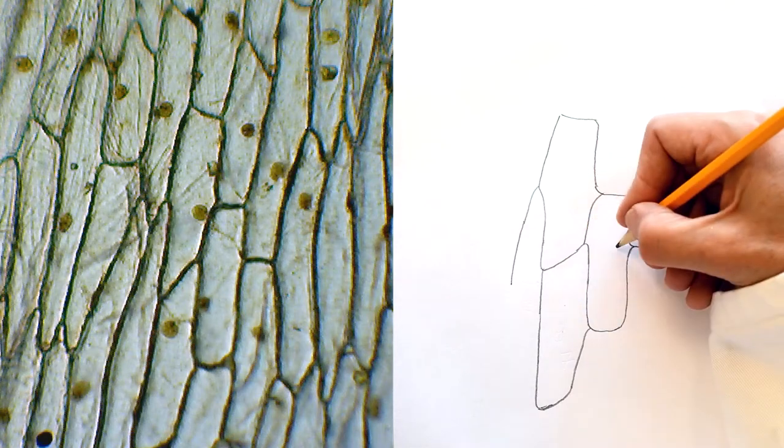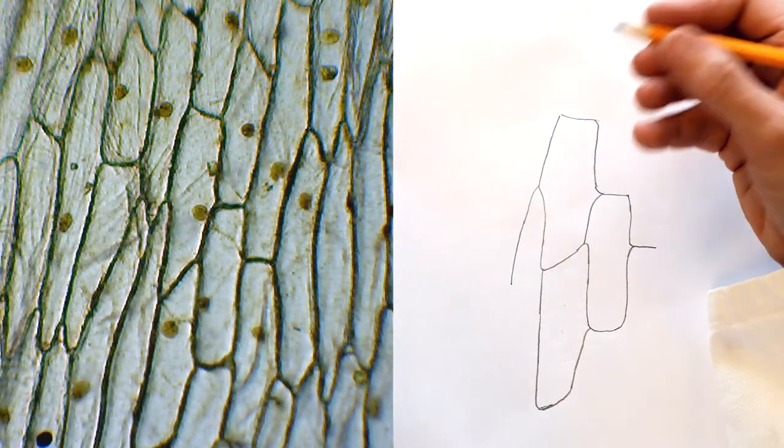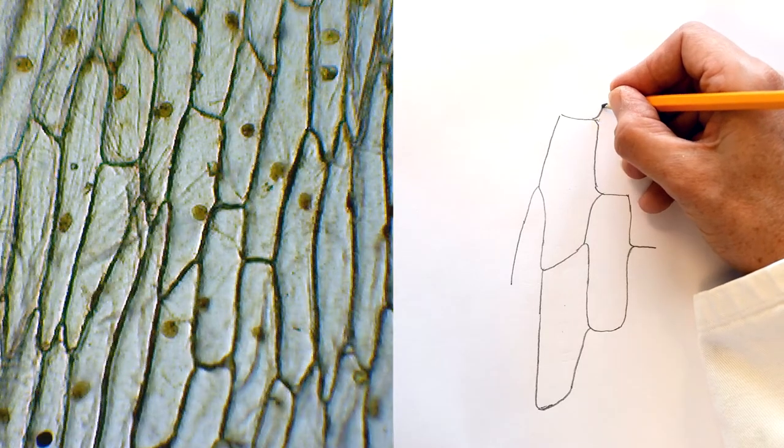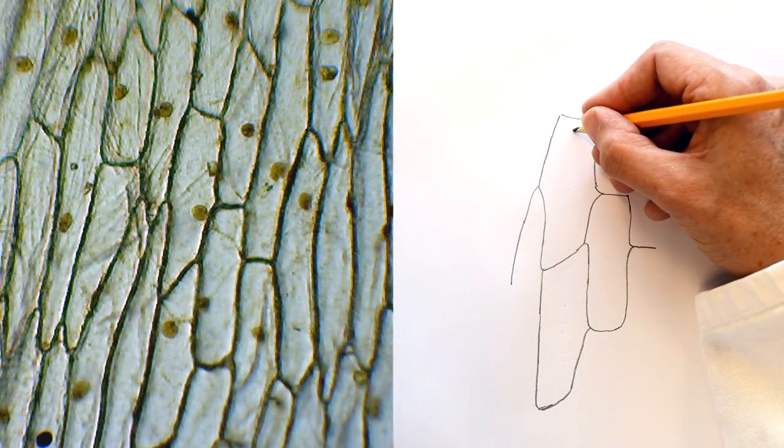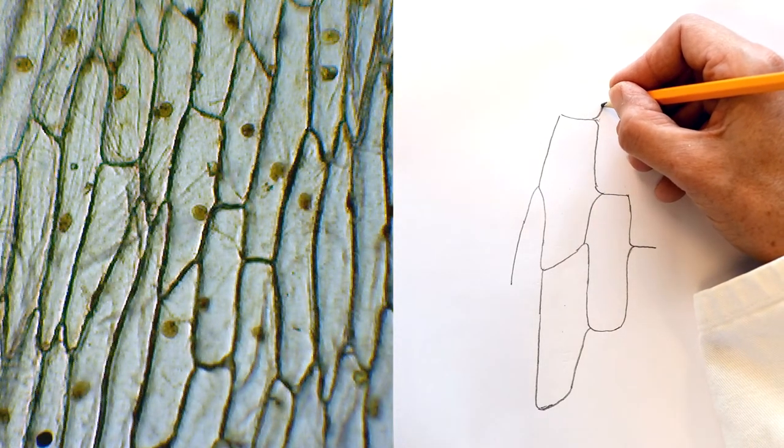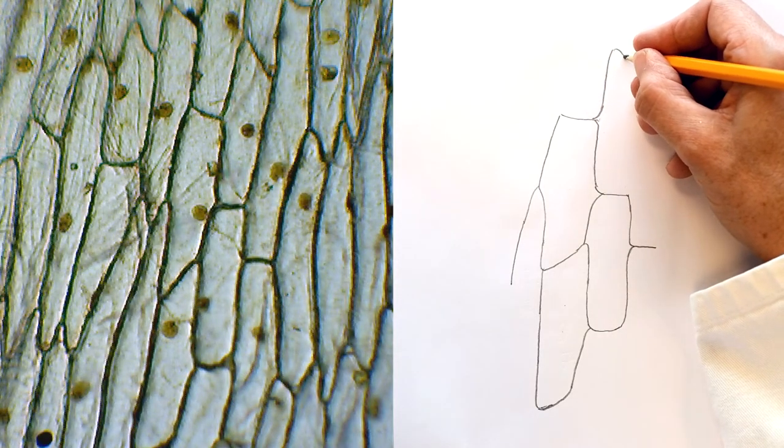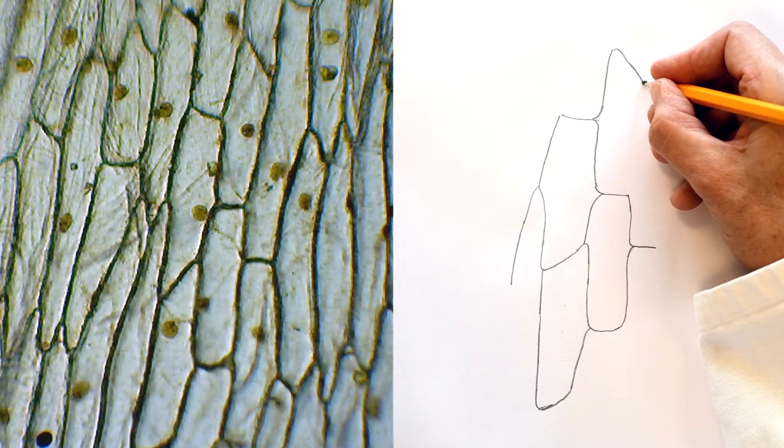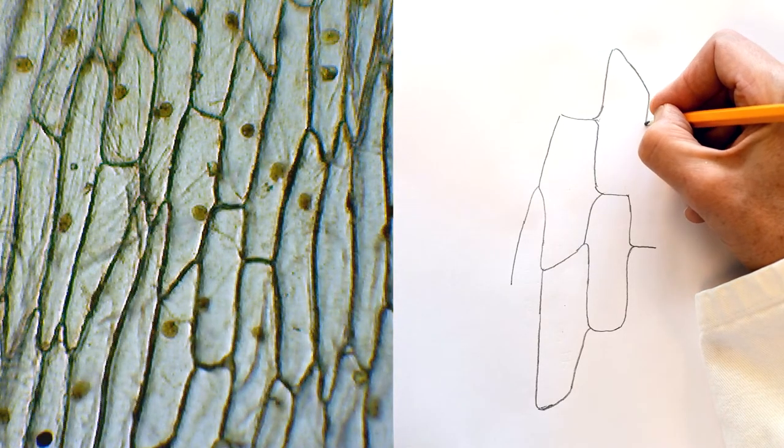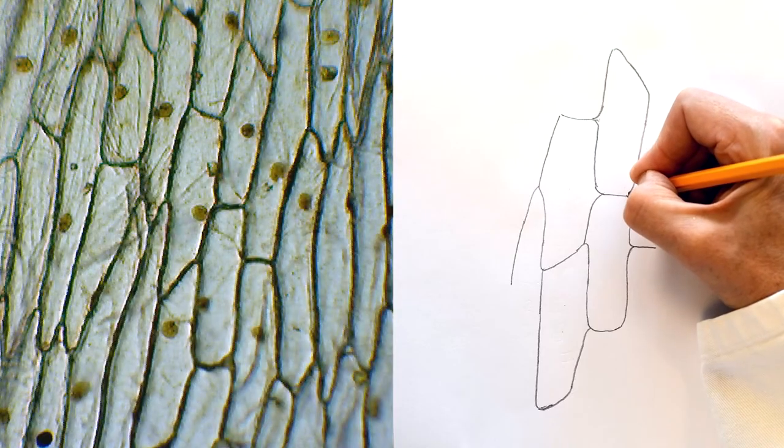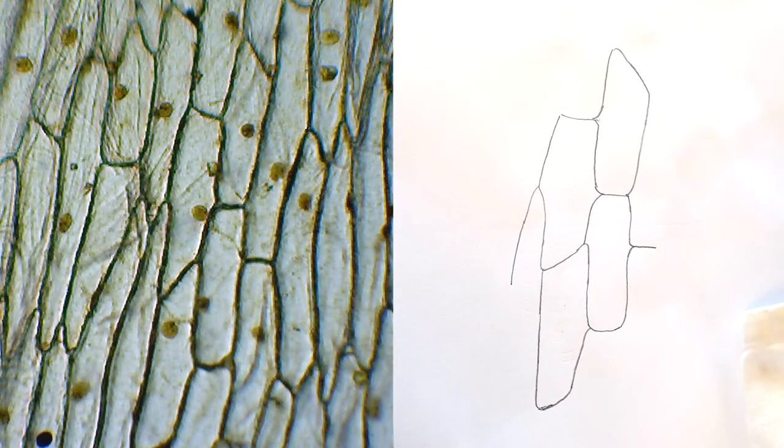Now I'm just going to finish, I've got three intact cells, I'm just going to finish this cell up here because it's got quite a nice shape, it's a nice interesting cell. It's got that nice little nick into its cell wall where it interacts with this one and now if I follow this cell up now I notice that this one has got a very angular top wall before it too comes back down and it hasn't actually got any unusual shapes on it interact with the others. Now I've drawn four cells.